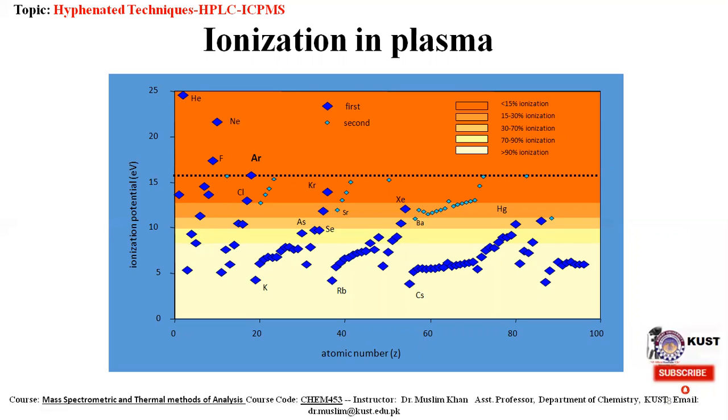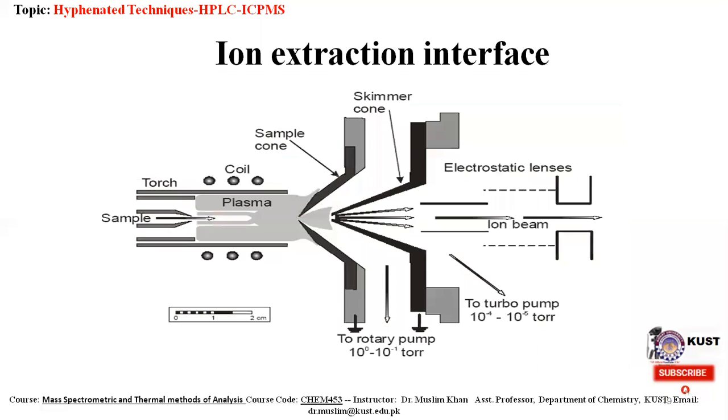If energy is then applied to the chromium ground state atom in the form of heat from a plasma discharge, one of the orbiting electrons will be stripped off the outer shell. This will result in only 23 electrons left orbiting the nucleus. Because the atom has lost a negative charge but still has 24 protons in the nucleus, it is converted into an ion with a net positive charge of plus 1. It still has an atomic mass of 52 and atomic number of 24, but is now a positively charged ion, not a neutral ground state atom. So this is how ions are produced in the plasma.